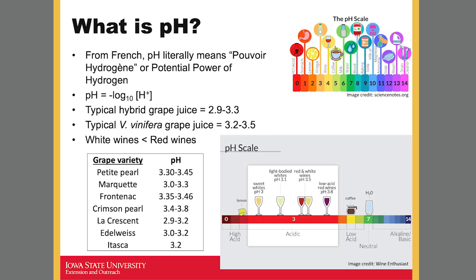But for this workshop, we're going to talk more about pH. And that's the power of hydrogen, or pouvoir hydrogène, which is where pH comes from.